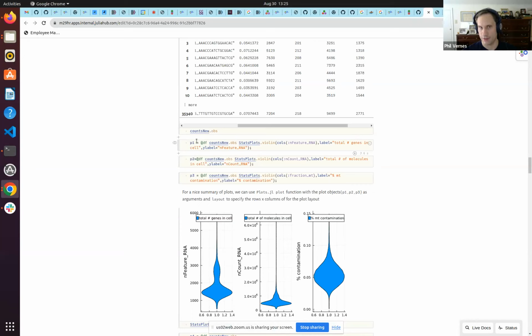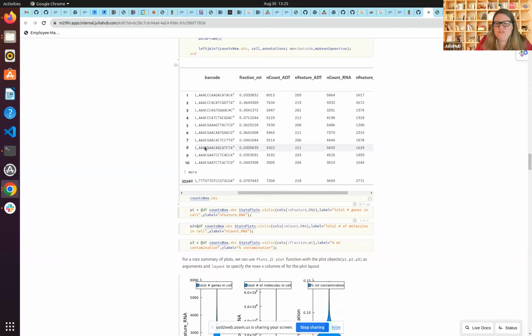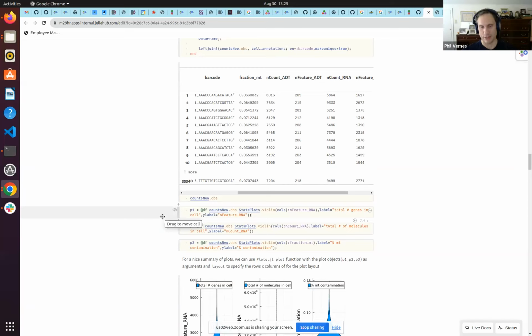Does this make sense? I have a couple questions, not quite directly related to that. The first is the matrix is sparse with several empty spaces. Does that mean the counts are 0? If not, how can we use the data for modeling? What does it tell us about the relation between the gene and the cell? We'll get there. This is all built into the package. Go ahead. And after that, there's one more.